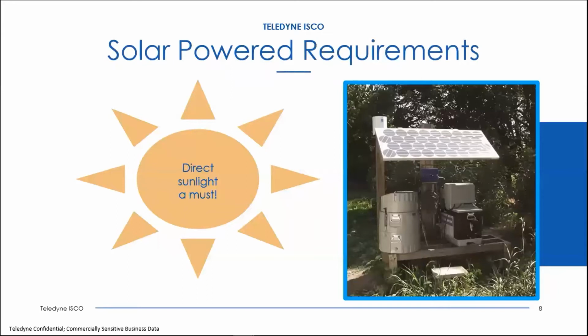Another thing to consider is power options. At remote sites where you're setting up these samplers, you don't have access to AC power, so you can't use the permanent refrigerated samplers. You have to use either the portable samplers or the portable refrigerated samplers. And if it's way out in the country and really hard to access, a lot of people will have a solar panel there as well. The solar panel maintains the battery while the sampler is sitting there, either waiting for a rain event or a discharge event or something like that.